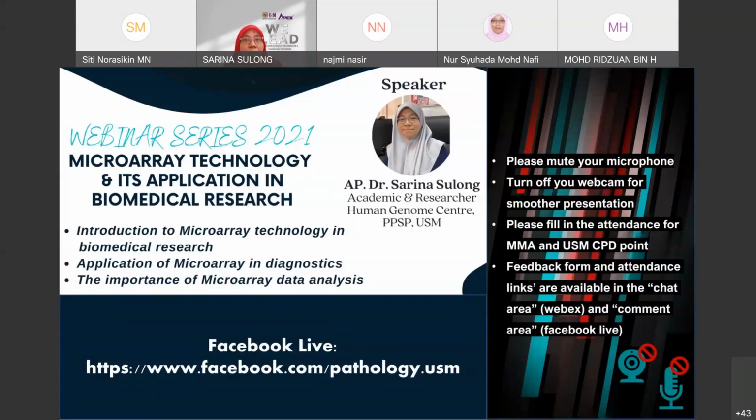From your experience, Dr. Sarina, can you share with us about the current situation in our school, whether we have an expert that can help with bioinformatics data analysis? And if we want to do microarray, for example, what should we do? Do we have to outsource the service, get a consultation, or establish some sort of collaboration?